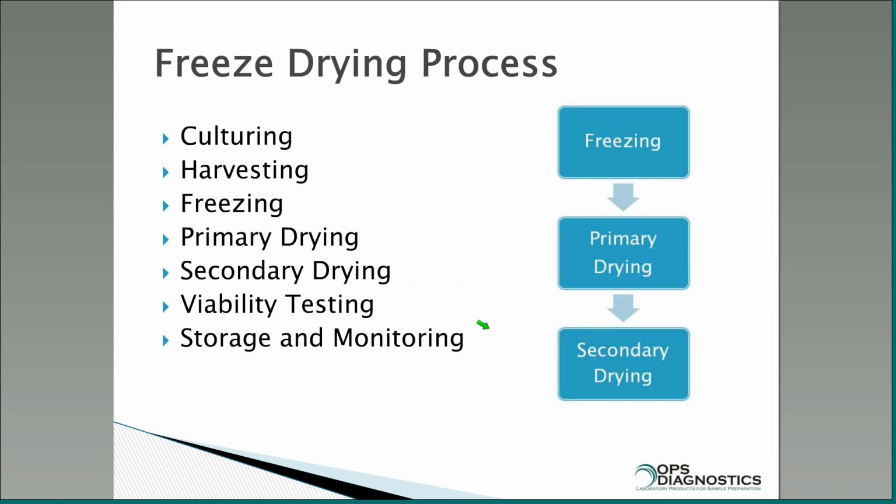Okay, so the steps in freeze drying. When you see descriptions in books, it often talks about freezing and then primary drying and then secondary drying. And that's all true, but there's actually a lot more to it.